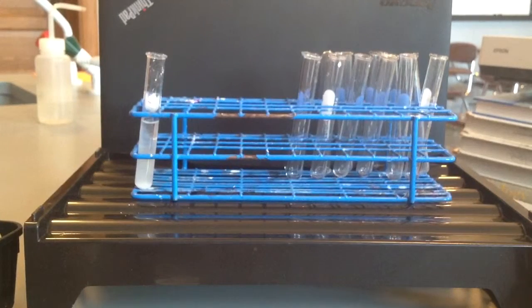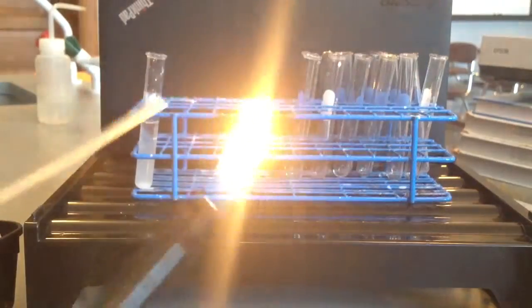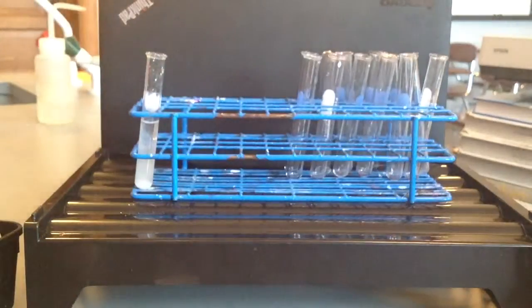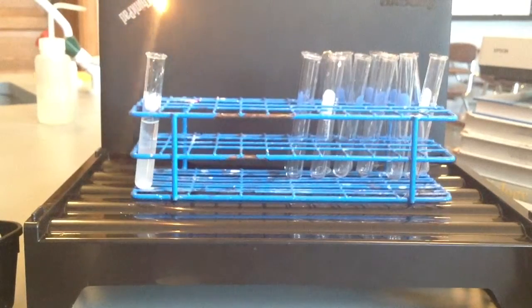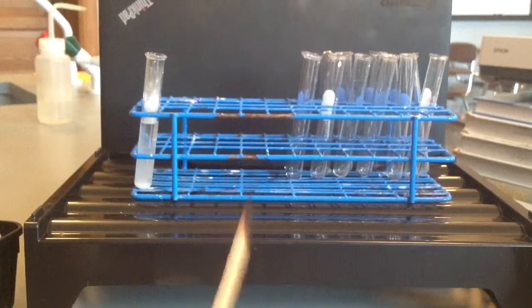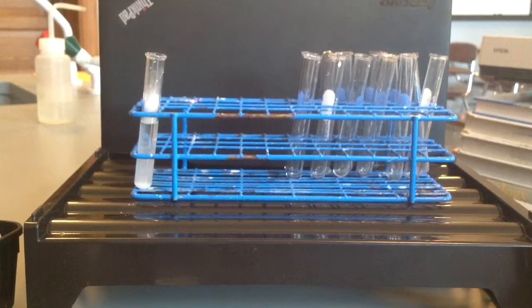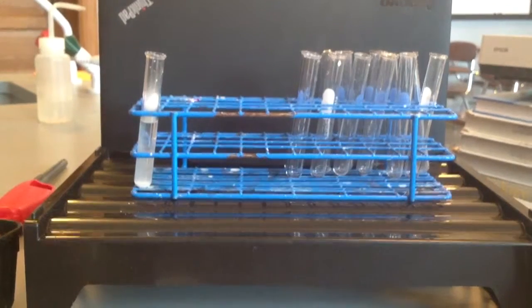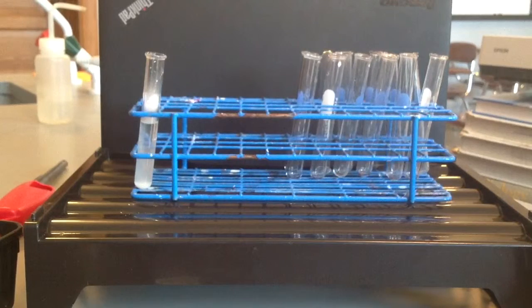Okay, it's probably been about a minute, but we'll go ahead and do our burning splint test. And there you go, there's your burning splint test. You can see, hopefully, what happened, and you can make your observations from there. All right, ready for the next reaction of step 2, which is the acetic acid and the calcium carbonate.